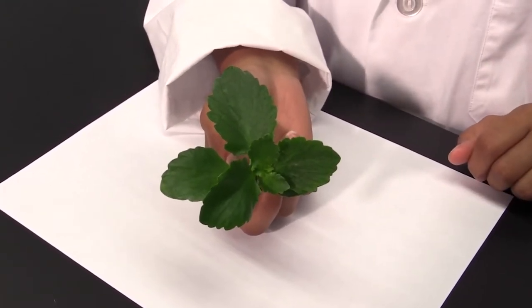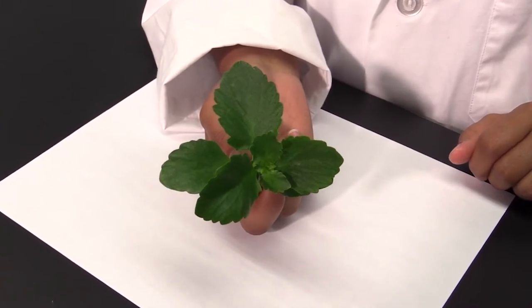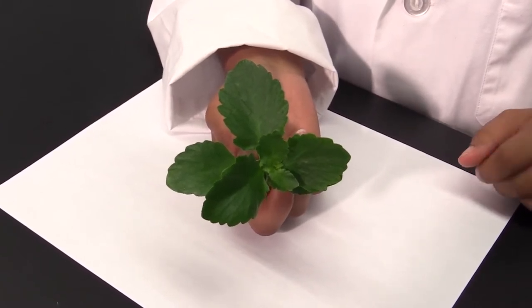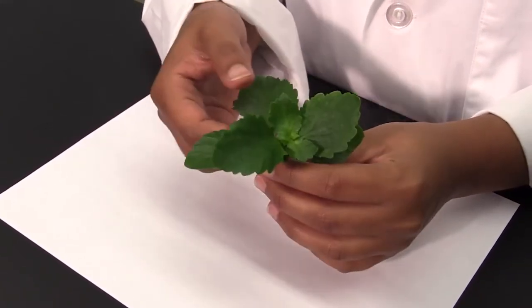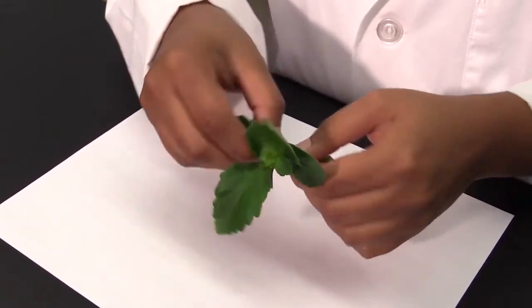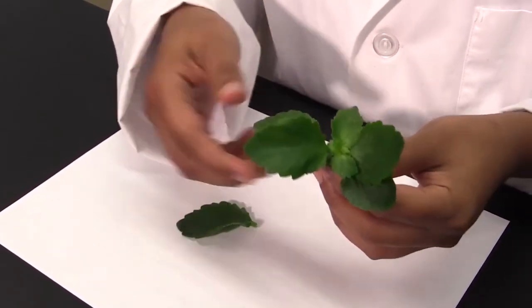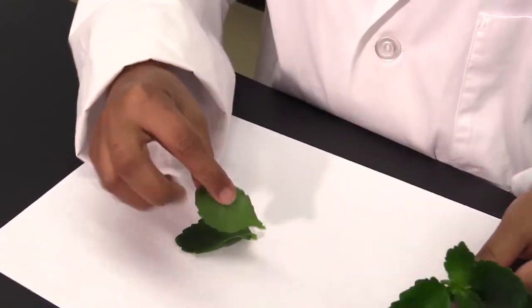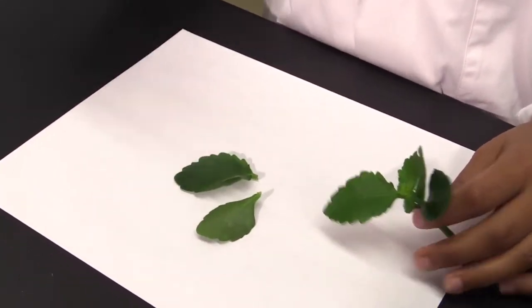If you have enough plant material for Part C, you can use two leaves. Begin by applying three patches of clear nail polish to both the ab-axial and ad-axial leaf surface.